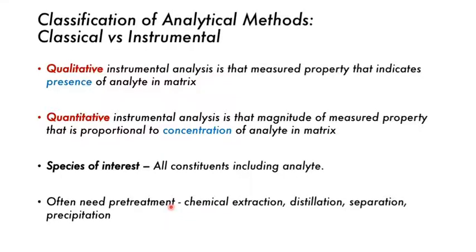We can just boil it off most times. Sometimes there are 2 or 3 species which absorb light at the same wavelength or the same position as the analyte that we're interested in, and we'll talk about chemical interference more later on. In that case we need to separate them somehow.